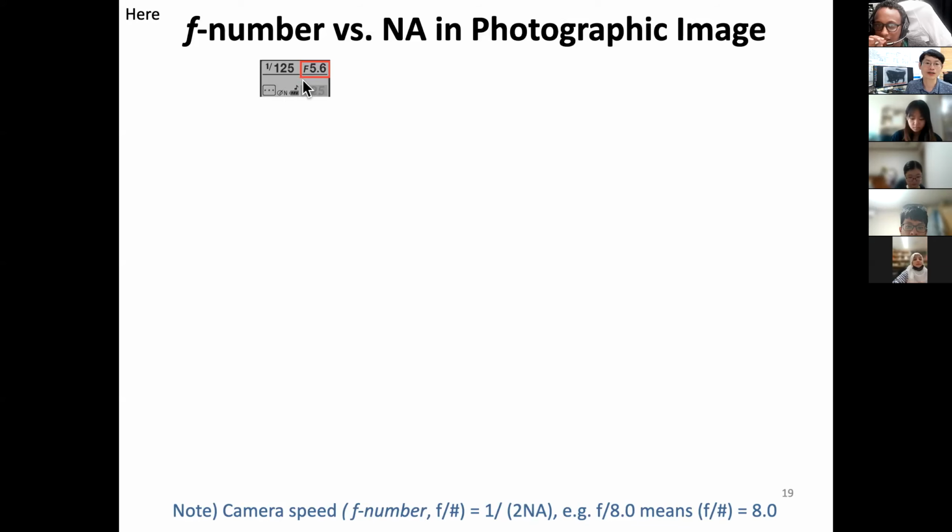So you see this one I showed you. 1/125, which I believe is the camera shutter speed, and f5.6. This is so famous for F number. Now we are seeing it less and less, but for those of you interested in photography, Jungmyo, I took it from your desk. These camera lenses actually have this, and if you look closely at the side.